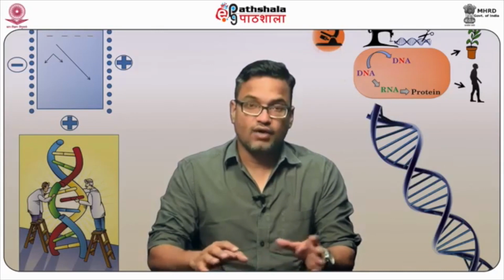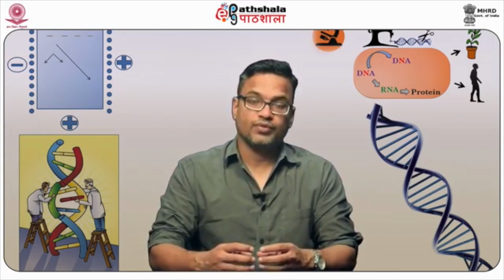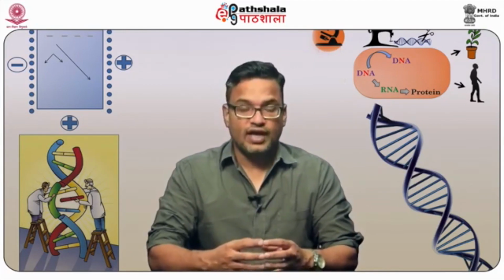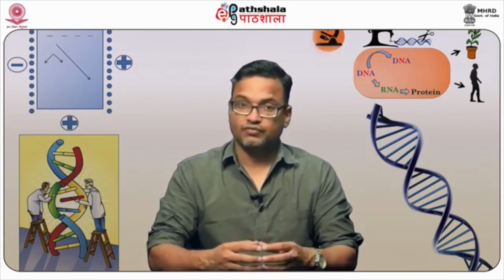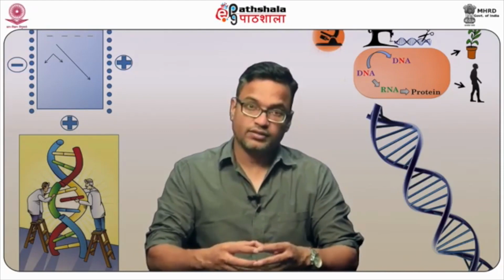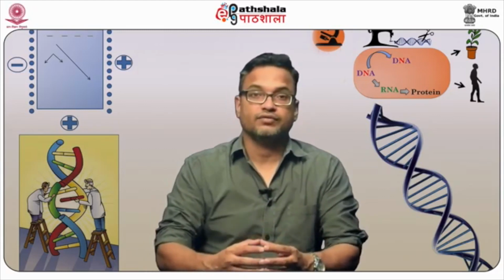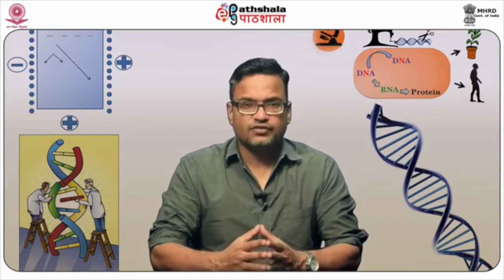Here's the schematic of how fluorescent imaging actually works. As I mentioned earlier, suppose you have a luminescent molecule, shown in blue here, in the ground state. Once you have an excitation wavelength which is shorter, low wavelength but high energy, your molecule takes up that energy, absorbs it, and goes to a higher state, shown in different rows up here. This entire reaction is very quick, as you can see from the time it takes to go from the ground state to the excited state.